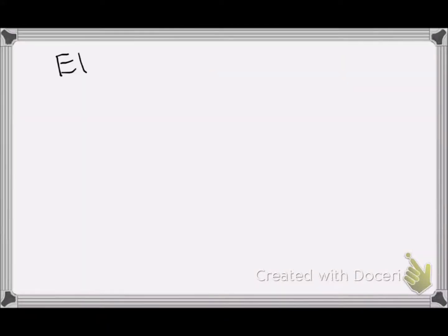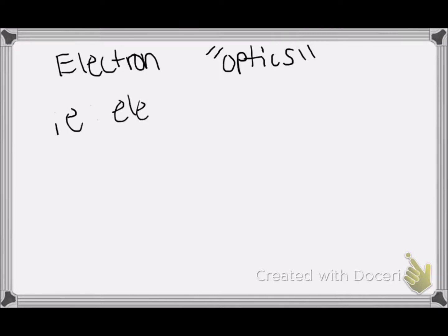Hello all. Today I'll be discussing with you the topic of electron optics, i.e. how electromagnetic lenses work, also known as what forms your image in a transmission electron microscope.